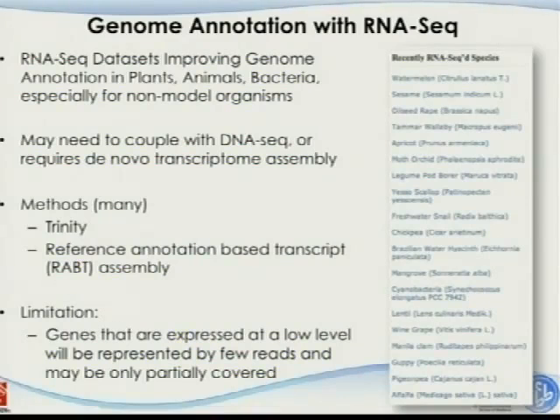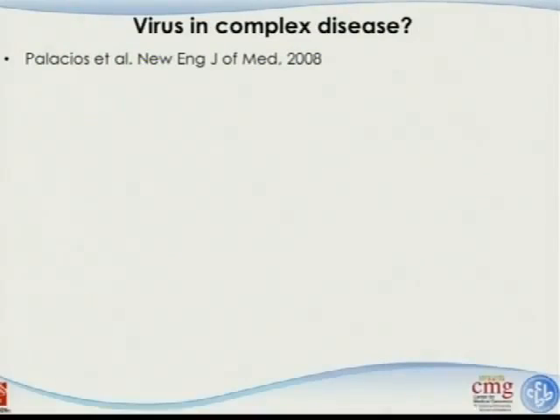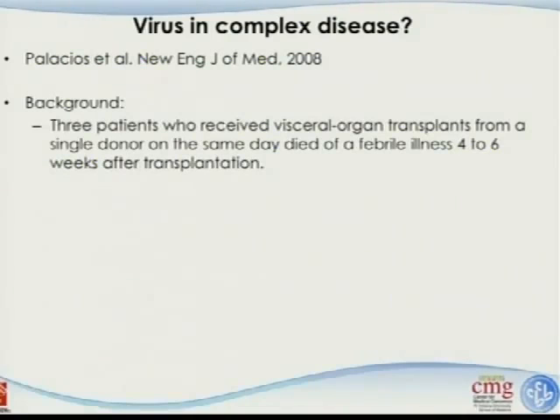But I suspect that with the increase in the capacity of DNA sequencing technology, this can be measured more and more accurately. Some people also, this falls into the metagenomics type of research area. In March 2008, a paper was published in the New England Journal of Medicine, and they already used this in a clinical application.